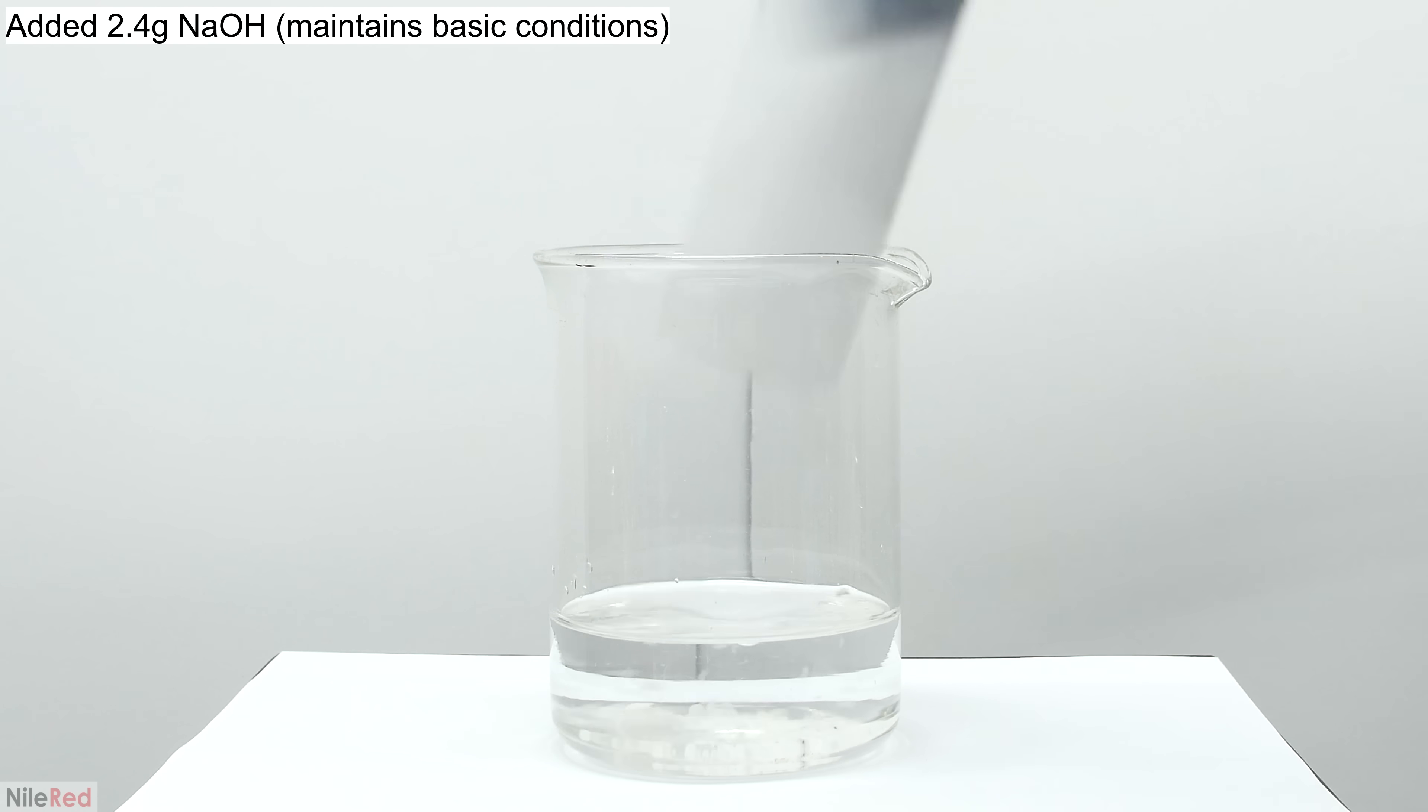Once we have a crystal clear solution again, I go ahead and dump in about 2.4 grams of sodium hydroxide. Some of the sodium hydroxide will react with the silver nitrate to form more silver oxide. But since we have an excess of ammonia present, just like before, the silver oxide will form a complex and dissolve into solution.